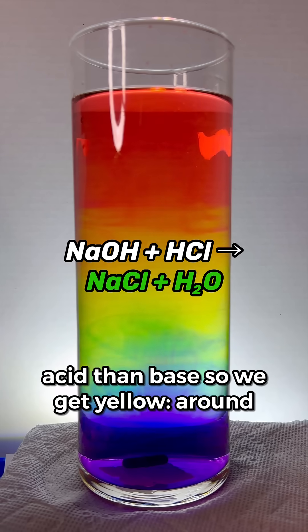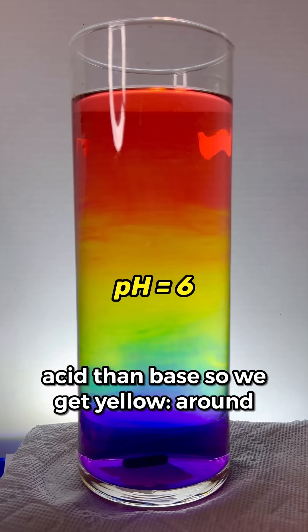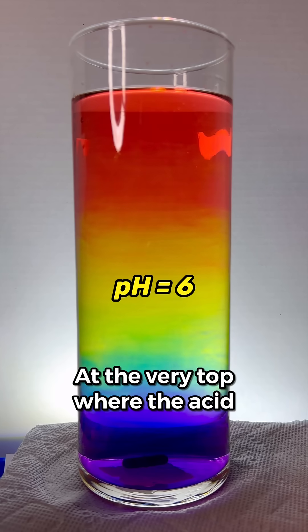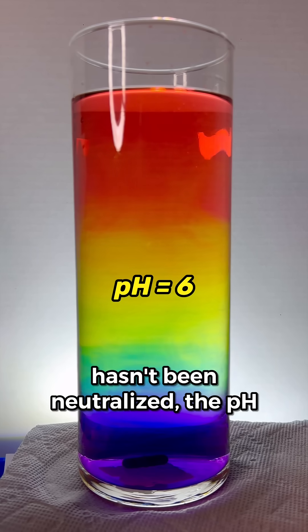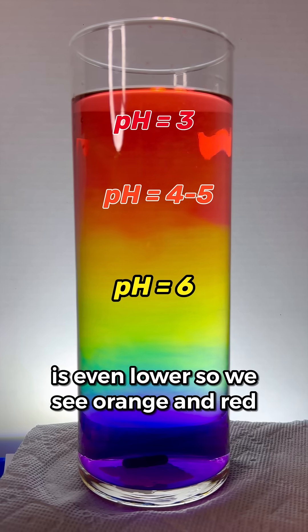Just above that, we get slightly more acid than base, so we get yellow, around pH 6. At the very top, where the acid hasn't been neutralized, the pH is even lower, so we see orange and red.